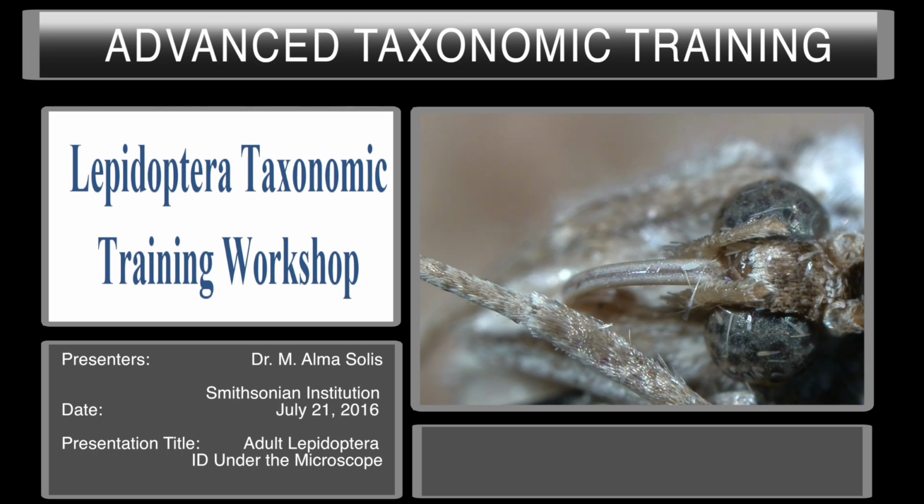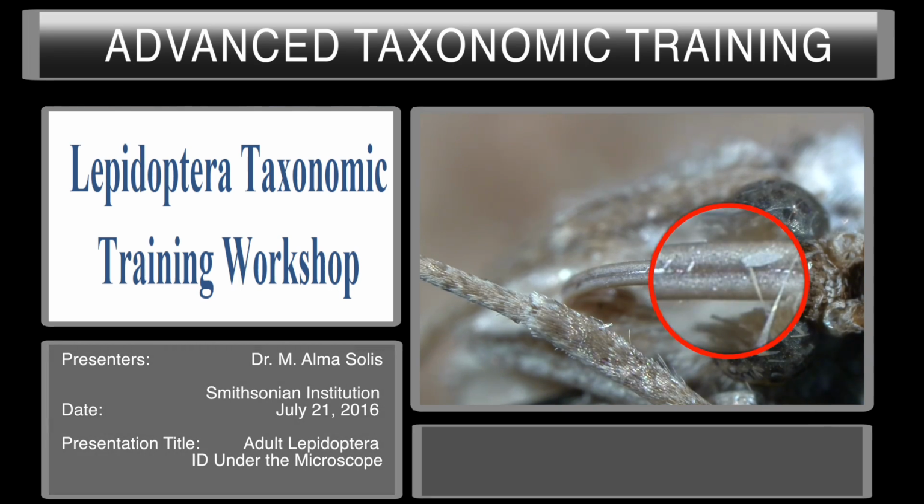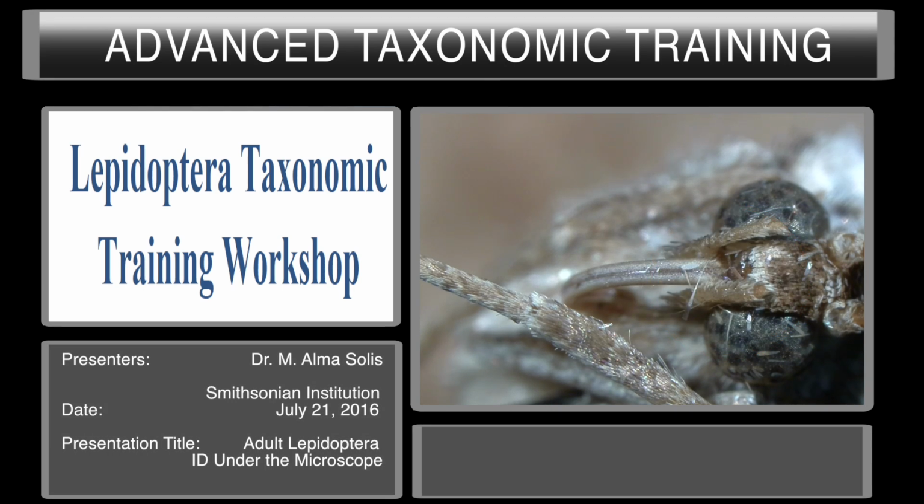This is a smooth proboscis. What you see here is, you see these scales lying about? There is no pattern here. It's just lying there in every which way. Those don't count. They're just there by accident. But if you look at the proboscis, it is absolutely smooth. There are no sockets to see.